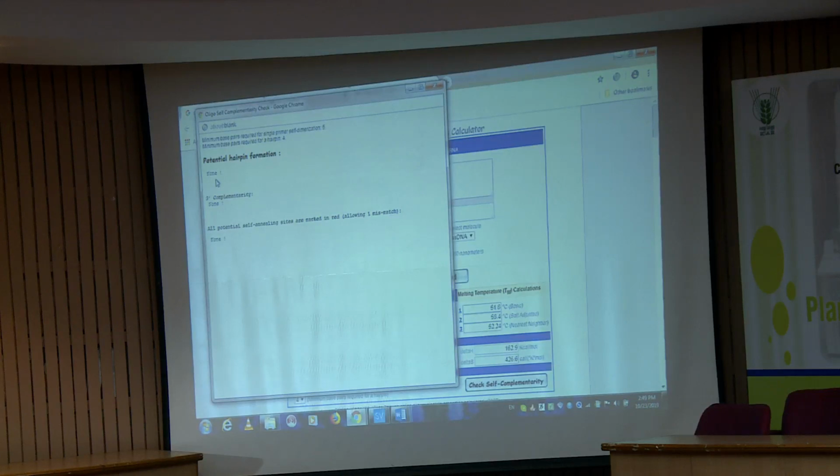And that stock, immediately freeze it at -20, because primers are very prone to degradation. This is a small single nucleotide only, right. So if you do a lot of freeze-thawing, then the last nucleotides have a tendency to start degrading one by one, and that will play a key role in your sequencing, because the sequencing data generated from a degraded primer is always noisy or mixed data, right.